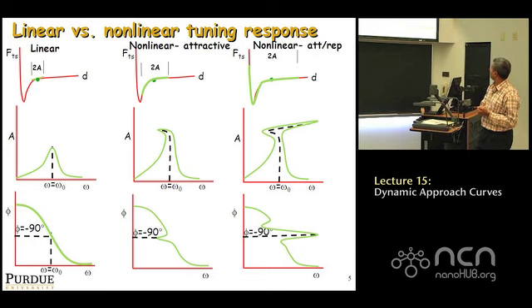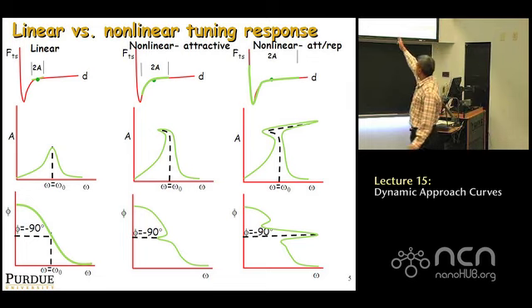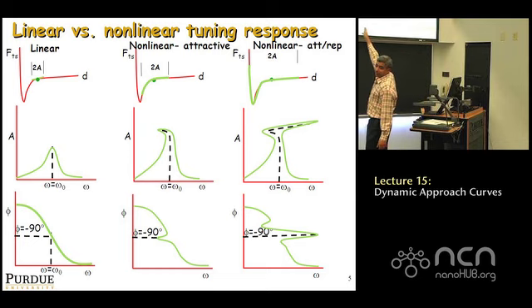I do want to highlight the fact that you can actually have situations, number one, where at a given frequency, there can be two oscillation amplitudes. You see this? So depending on the drive frequency, I can take a drive frequency somewhere here, but I look up and there is more than one amplitude possible for a given drive frequency.